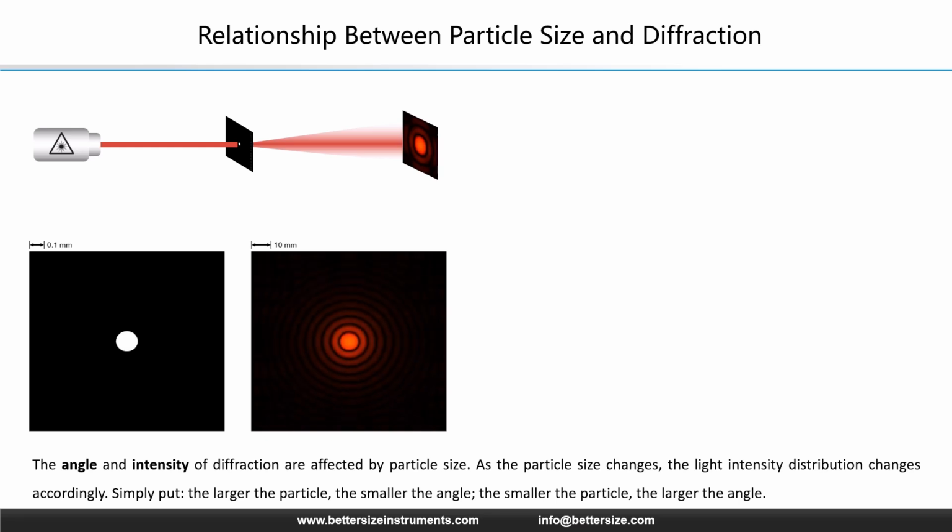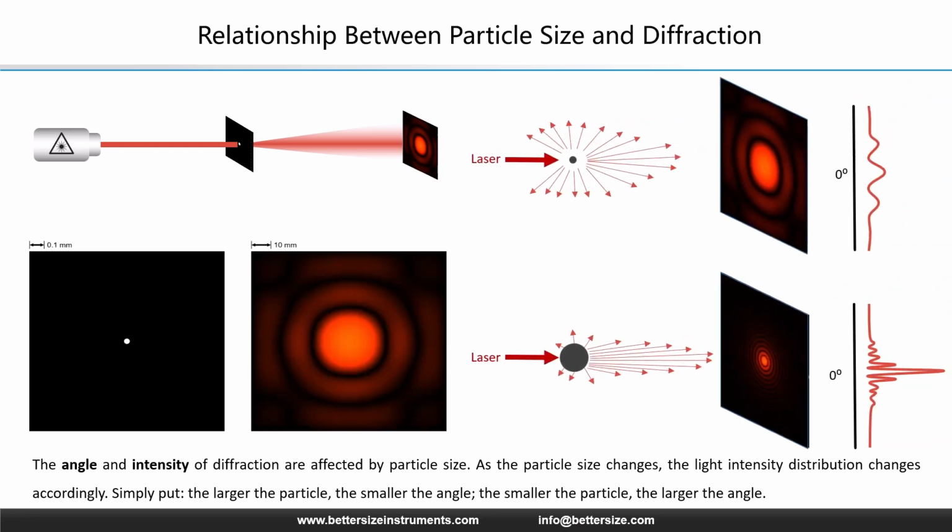Now, watch the animation carefully. As the particle changes size, the pattern breathes. You will notice a fundamental counterintuitive behavior. As the particle gets smaller, the pattern gets bigger. As the particle gets larger, the pattern gets smaller. This is the inverse relationship that drives our entire industry. Let's freeze that motion to make it clear.